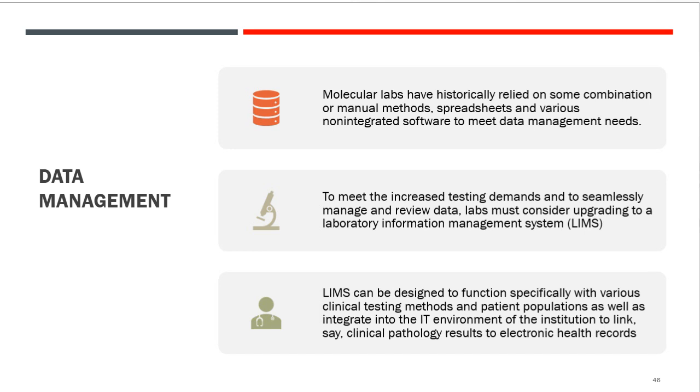There are increasing testing demands that need to manage and review data. They need to communicate with the hospital system and patient reports and nursing stations. Labs must consider, kind of halfway between shall and should, must consider upgrading to a laboratory information system.